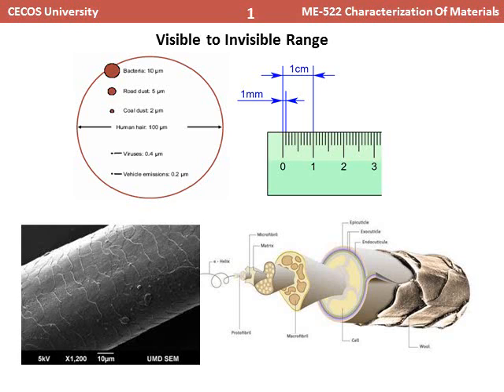So as I mentioned, the hair, a big circle. If we can see this hair, just a normal human being hair, by scanning electron microscopy, then the things that are visible to us by naked eye are totally different if we visualize the object under scanning electron microscopy.